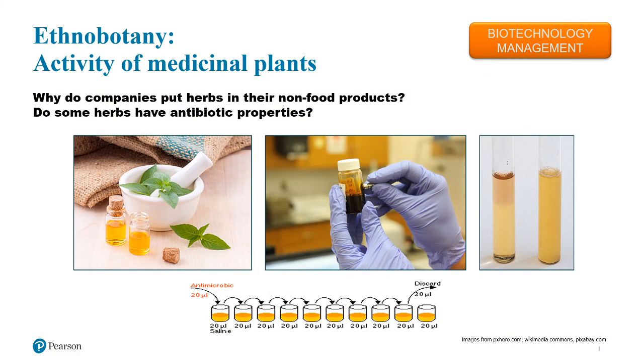Ethnobotany. Do you enjoy herbal detergents or products just because of how they smell? Well, there's another reason why these ingredients are added to the products. It's to enhance their antimicrobial and antibacterial activities. In this experiment, students investigate the activity of medicinal plants against selected microorganisms. They do so by using a microdilution broth method, which involves mixing different concentrations of plant extract and bacteria. Following subsequent incubation, microbial growth is then determined by use of growth indicators.